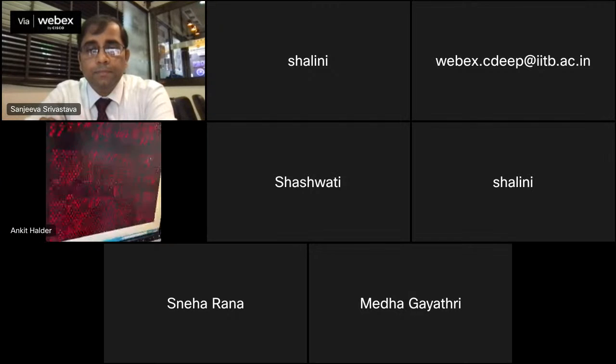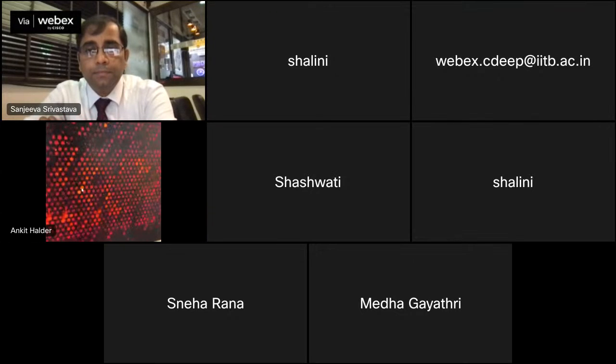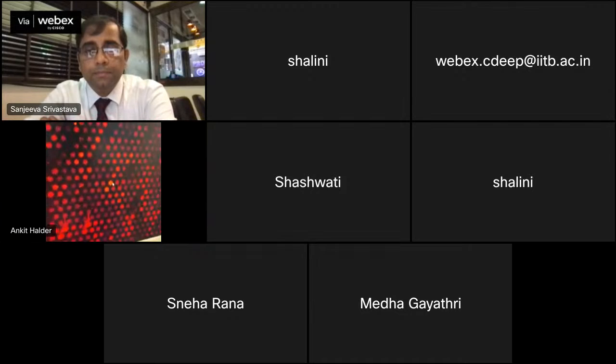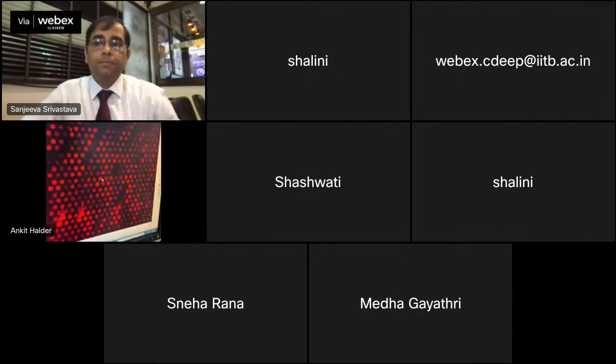Now I want to show how the chips look after this scanning. You can see this is a complete image of a particular slide. These spots you can see are very intense spots, which can be taken as biomarkers. Finally we need to go through a long process of data analysis in our programming language. Then we can determine which is particularly a biomarker.